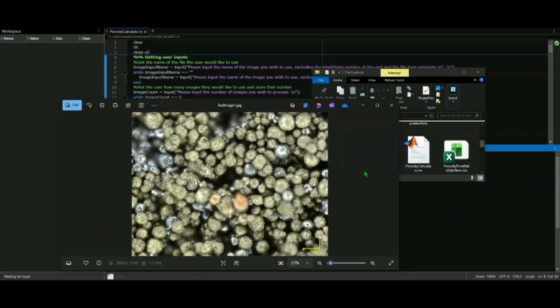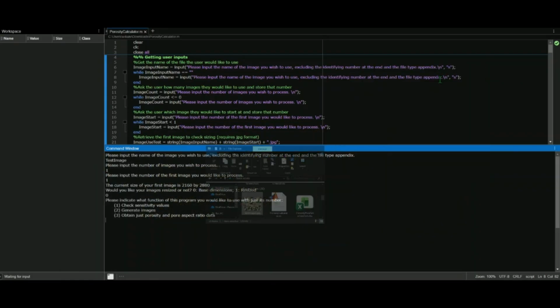So that threshold value can be anywhere from 1 to 255. I didn't know where to start because I was modeling it from a paper, but the paper did not give any sort of value. So in order to find the threshold values that give us accurate numbers, I had to first run through all of them. So that's the first aspect of this program. I'm just going to go ahead and explain the other two, and then we'll go through each one.